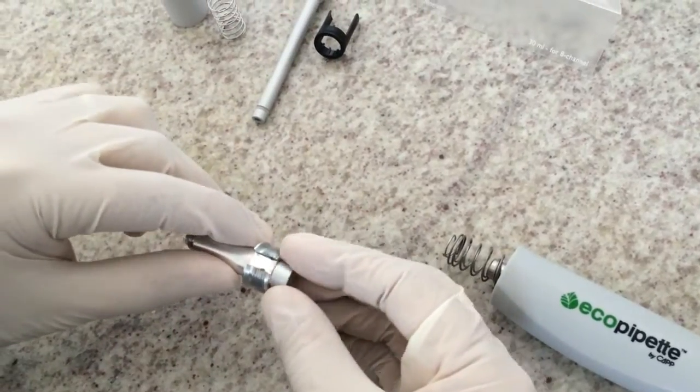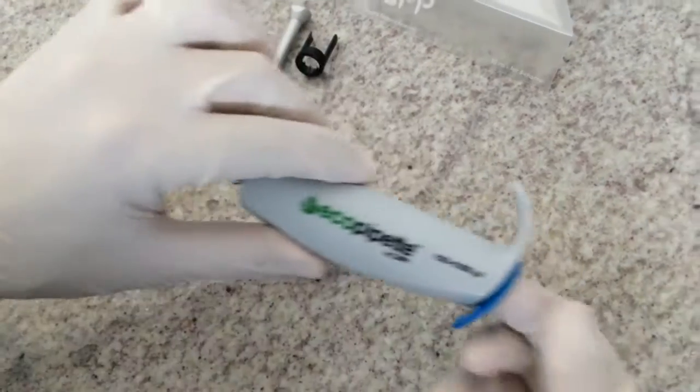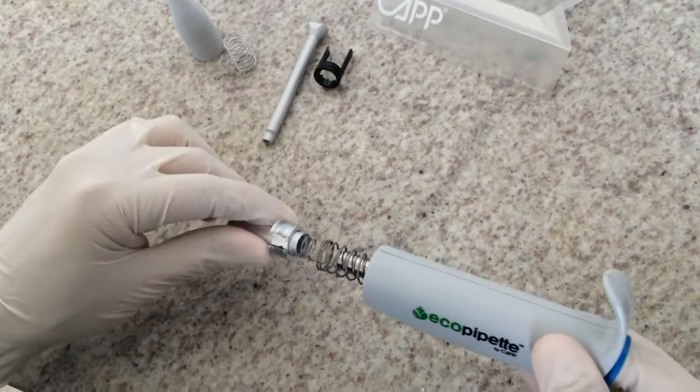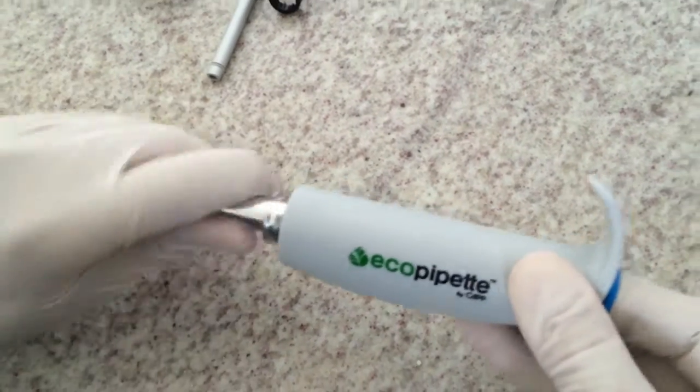Connect it to the bottom part. Then I will place my index finger on the back side of the pipette to assist in connecting the pipette body into the bottom part.